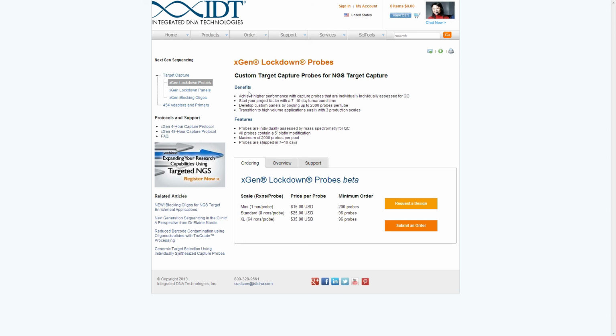I don't think read length is the limitation. We have done extensive development work with the Illumina and Ion Torrent platforms. We have used the 250 by 250 paired-end chemistry, along with, we've done most of our development work on the 150 by 150 chemistry. And then for the Ion Torrent platform, I'm not exactly sure which chemistry we've been using, but it's off the 318 chip and 316 chip. I know that we've been working off of that.